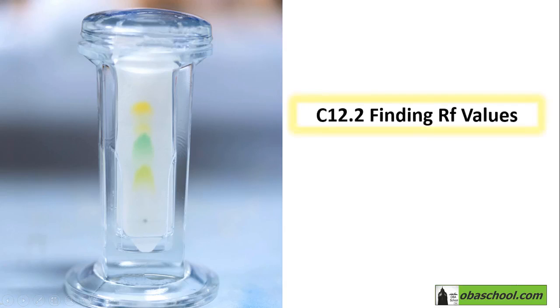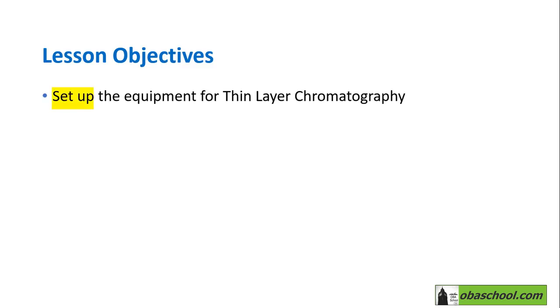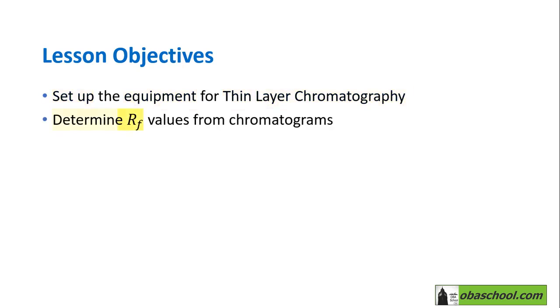Welcome back to chapter 12.2, Finding RF Values, the required practical. By the end of this video, you will be able to set up the equipment for thin layer chromatography and determine RF values from chromatograms.